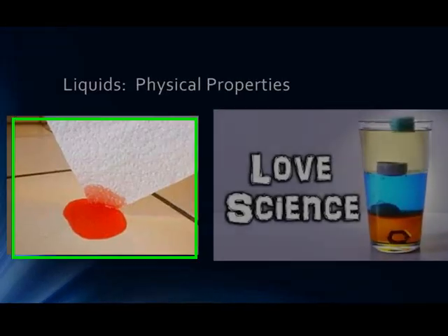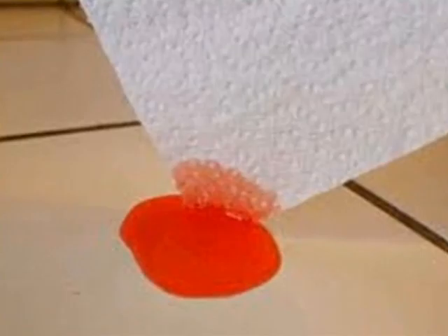You will also observe the distance that a liquid travels up a paper towel. The tiny fibers in the paper act as conduits for polar liquids such as water to climb upward against the force of gravity. This phenomenon, known as capillary action, results from the attractions or adhesion of liquid molecules to the sides of a narrow tube or outside the paper's fibers.